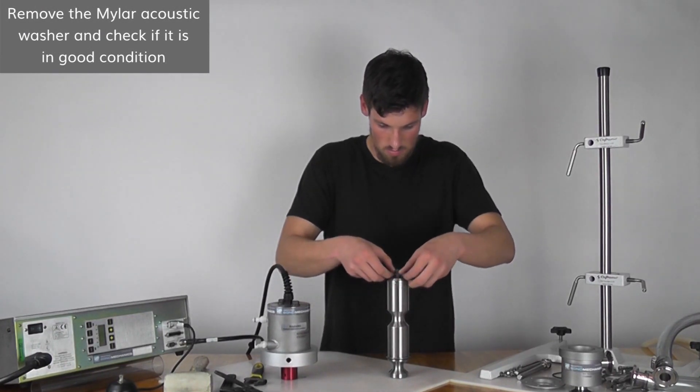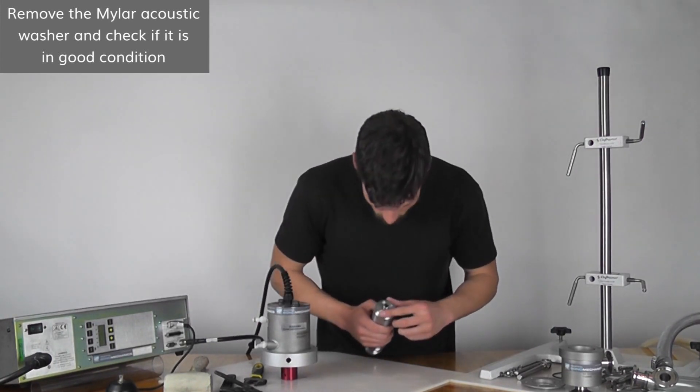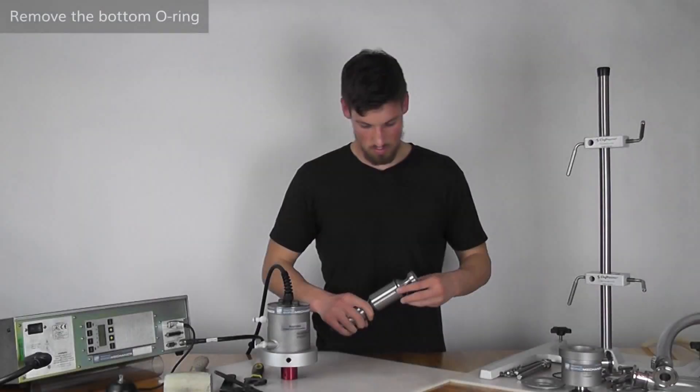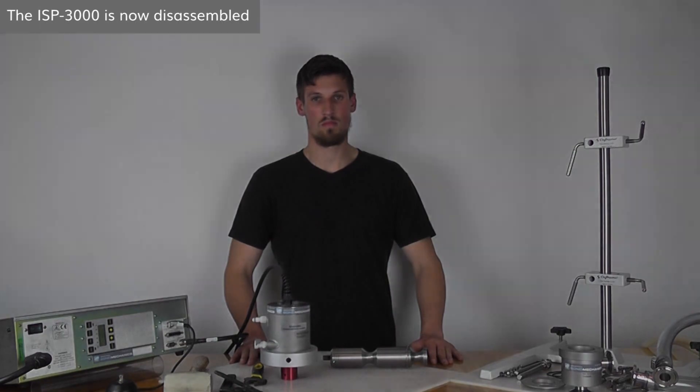Next, remove the mylar acoustic washer to make sure that it is clean of any particles or scratches. Remove the bottom o-ring from below the flange of the barbell horn. The ISP3000 is now disassembled.